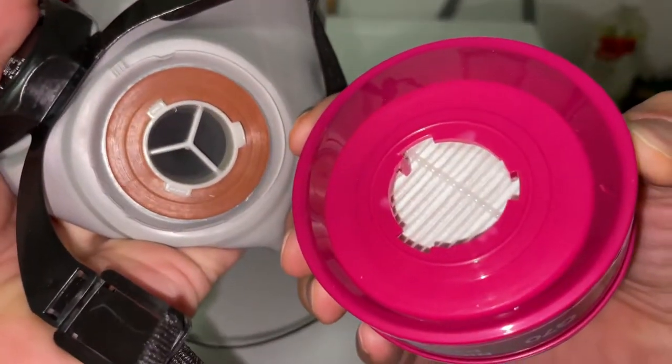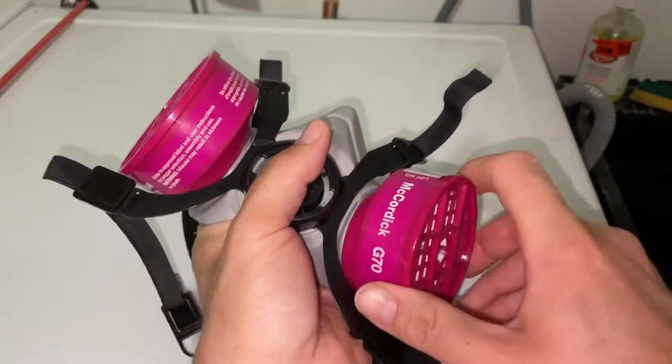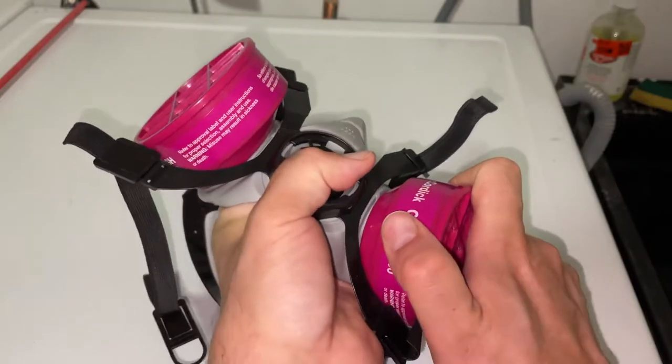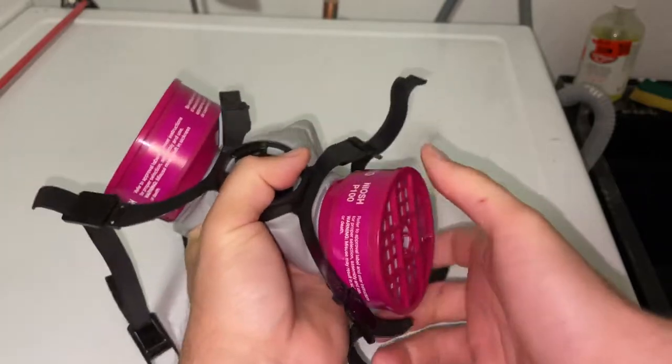You'll see the tabs that line up. Once you have your new cartridge, grab it, put it on just the same way that you took the old one off, twist it a quarter turn until it doesn't go any further.